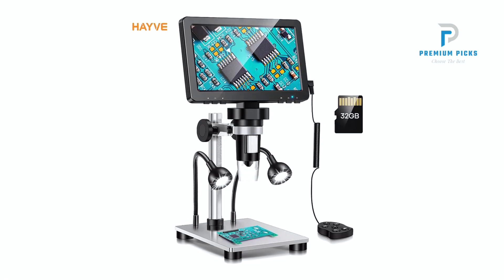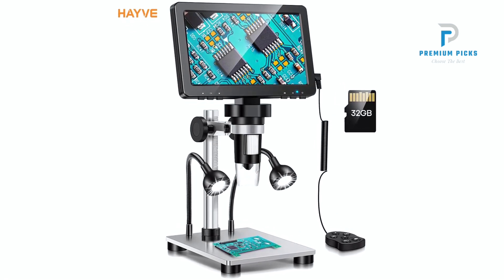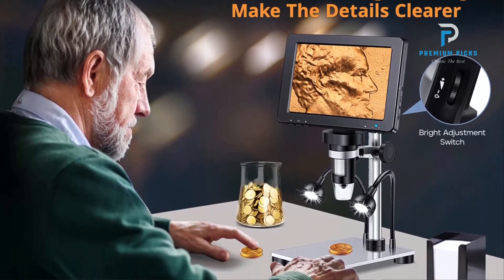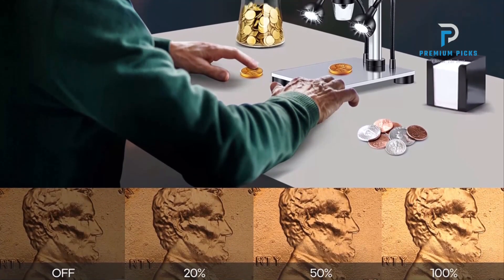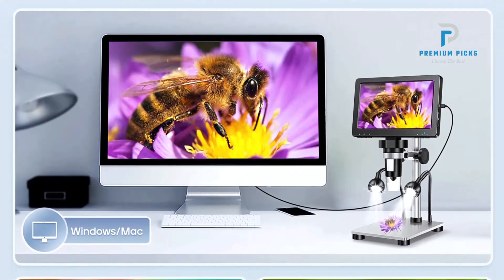Versatile Imaging Options: Equipped with a 1/4-inch optic lens and multiple picture and video resolutions — including 12M, 10M, 8M, and 5M for pictures, and 1080FHD, 1080p, and 720p for videos — the DM9 ensures superior image quality across various magnification levels.